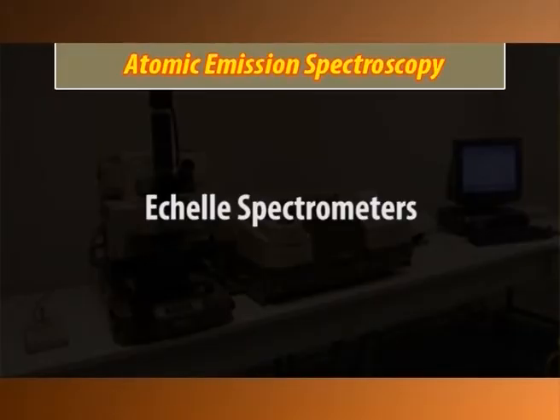Echelle spectrometers. Echelle gratings provide excellent dispersion and resolution over a wide range of wavelengths in a relatively compact instrument. The different orders appear in horizontal lines, with the longer wavelengths of the lowest order appearing at the bottom and the highest order at the top. Here, the prism cross-dispersing element separates the wavelengths in the vertical direction, while the Echelle grating separates them horizontally.